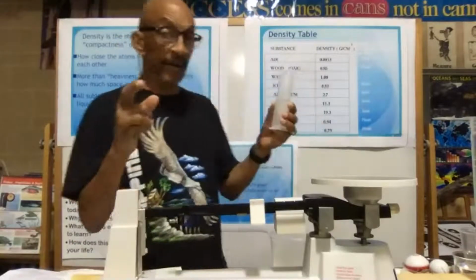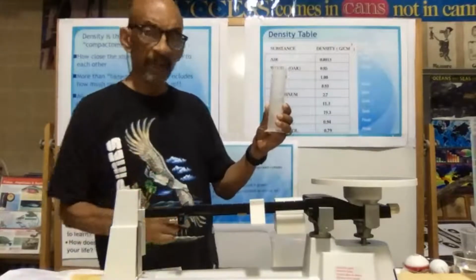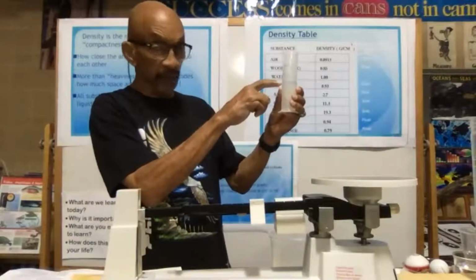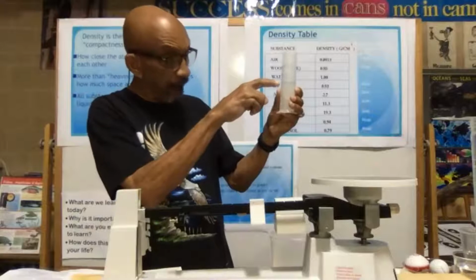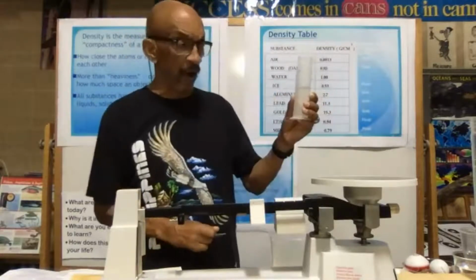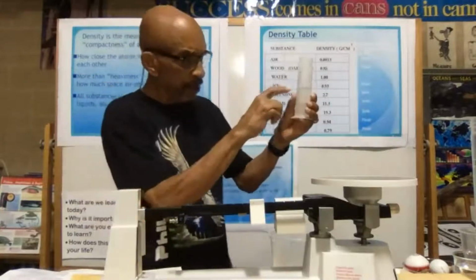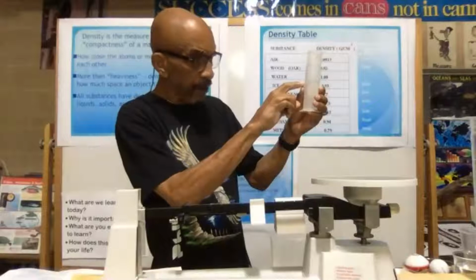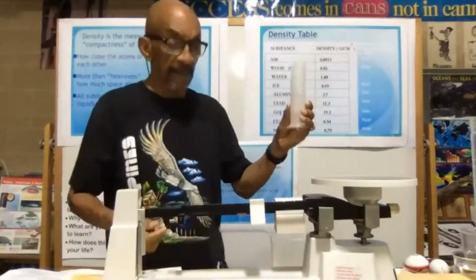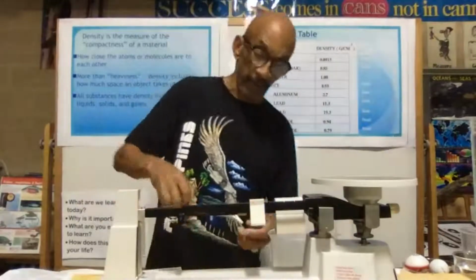Now, remember this, there is something called a meniscus. What that is, it's a little curve that's going to exist within that graduated cylinder. That water line is not going to be straight across. It's going to have a little dip in it. And so when you measure, you make sure that you're measuring at the point of the dip, not the edges, okay?